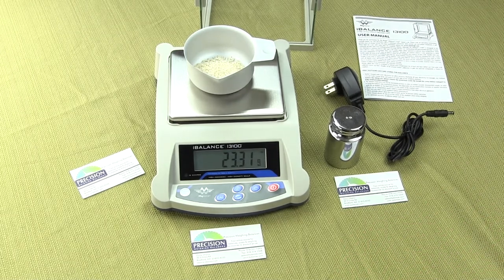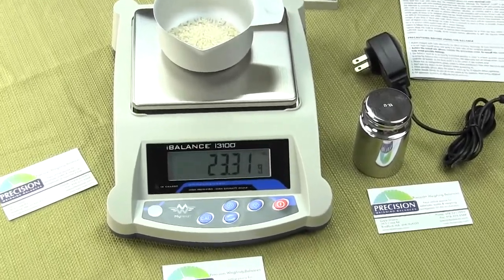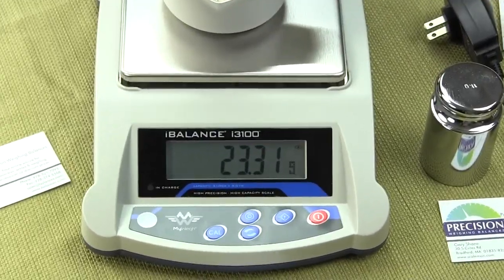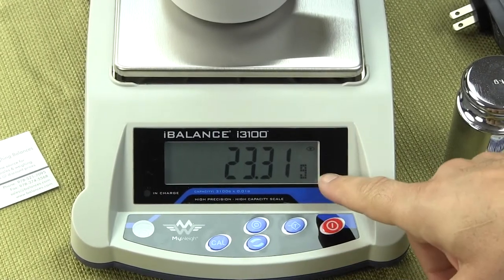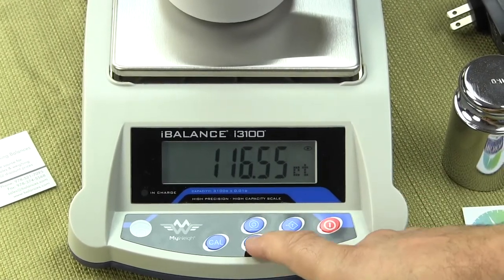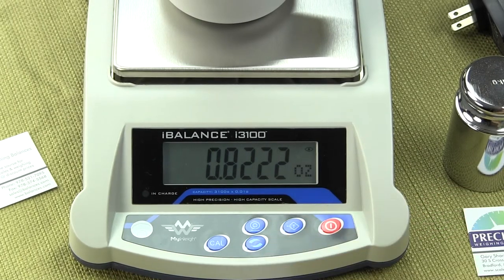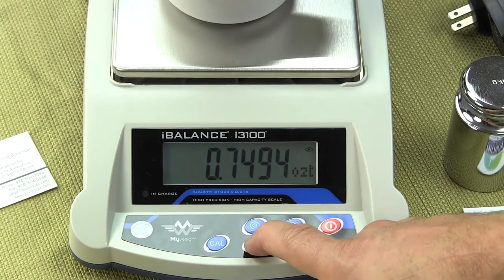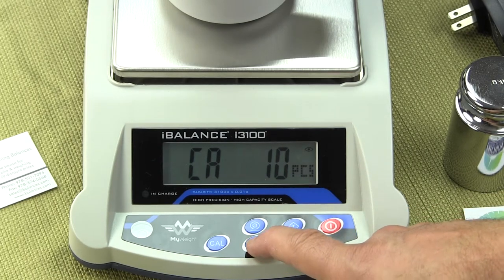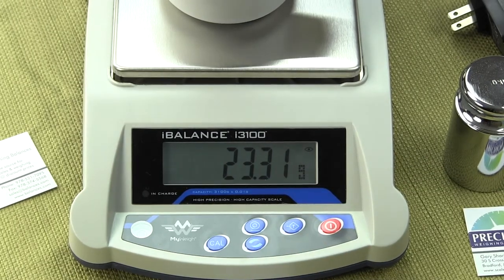Changing the weigh modes is extremely simple. Right now we're in grams — simply press the mode key and we are now in carats. Press the mode key again and we are in ounces, then troy ounces, then parts counting mode if you wanted to use that, and back to grams. Very flexible for almost any application you need.